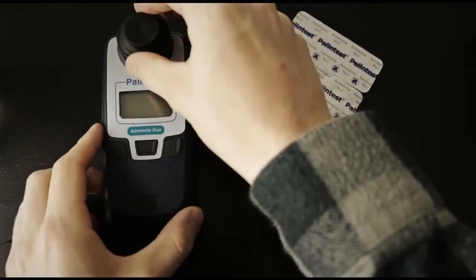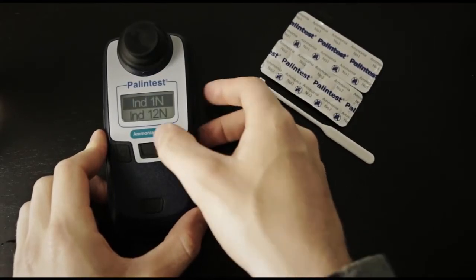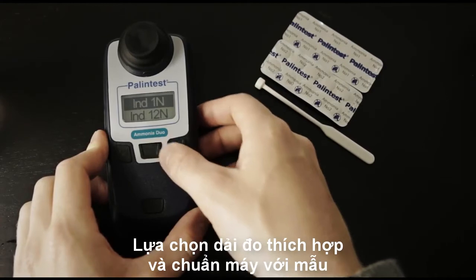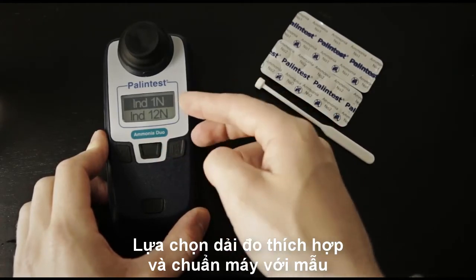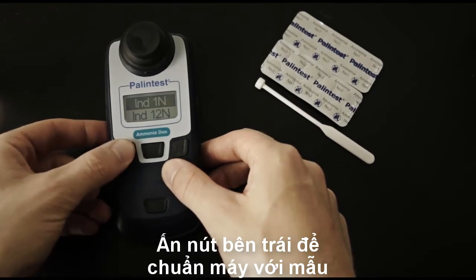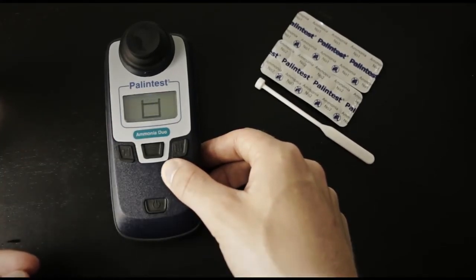Insert it into the instrument, power it on, and scroll through the menu to find the appropriate test. In this case, we're going to do the Indophenol 1N method. Press the left blanking button, and the instrument is now ready to measure.